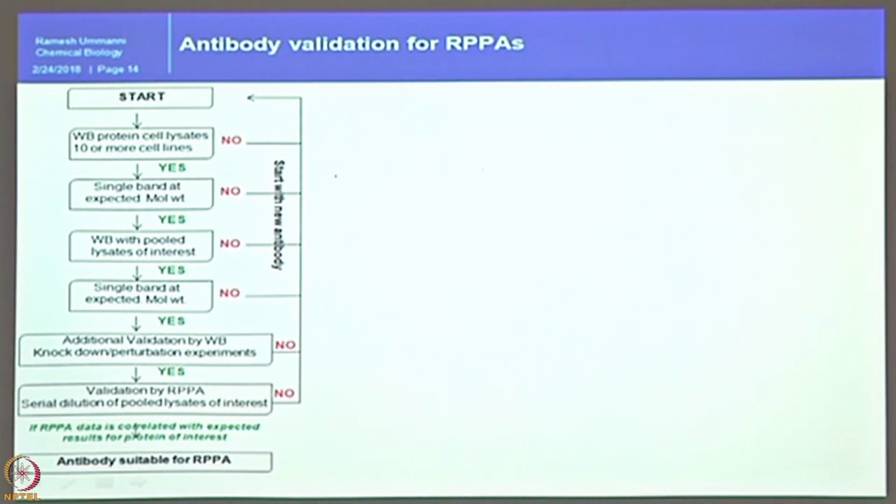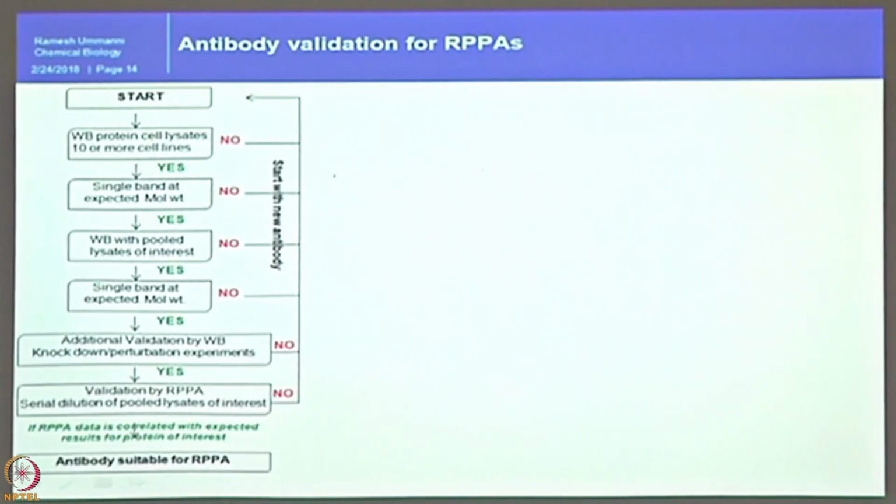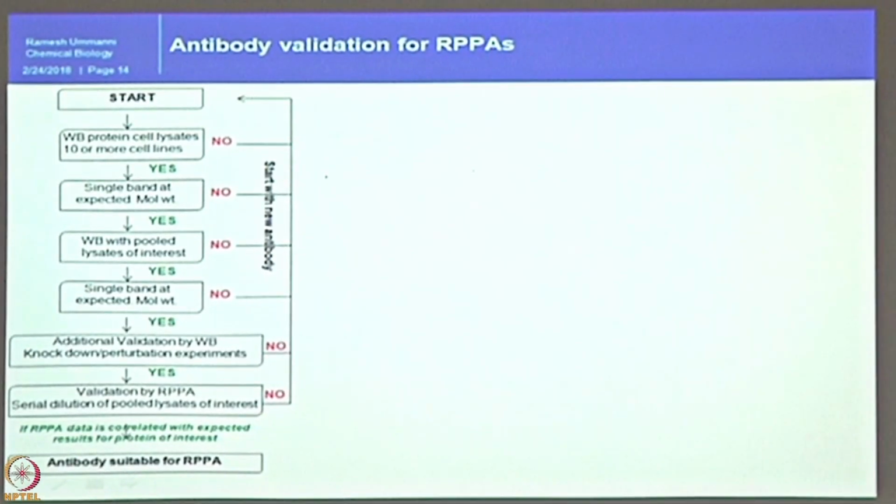Here you need to spend at least a couple of months to years to establish an antibody panel in your lab. At least we could establish, with my postdoc supervisor, a 190 antibody panel in 1 year from 3000 antibodies purchased from the market. You can see that 2800 plus antibodies just went into the dustbin of the German Cancer Center at that time. Now those antibodies we are repeatedly purchasing and using, but this 1 year effort helped in the long run, definitely.